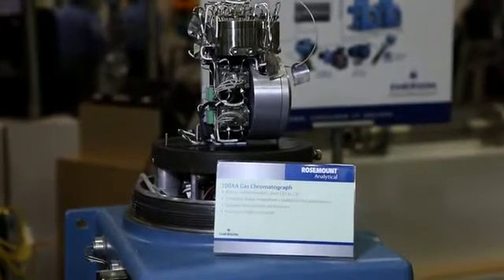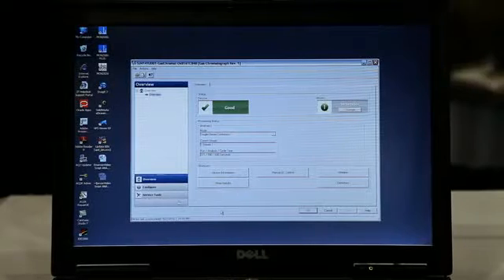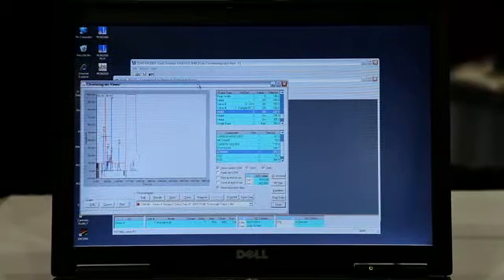The 700XA is also easy to communicate with. It has what we call our MON 2020 workstation software, which can be accessed via a serial connection or via Ethernet. For customers already utilizing AMS Device Manager, you can tie right in via the Foundation Fieldbus module available in the 700XA and get all those diagnostics with very clear alert messages and reports that you're familiar with from other Emerson products.